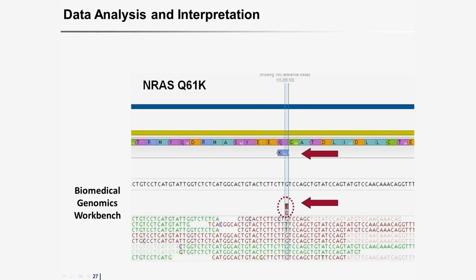So from a table of variants, you can interactively switch to a gene read view, showing then the region of base exchange and also the amino acid track where you can see then the amino acid change. And that is quite nice, I think.